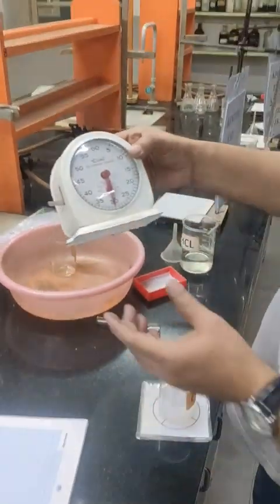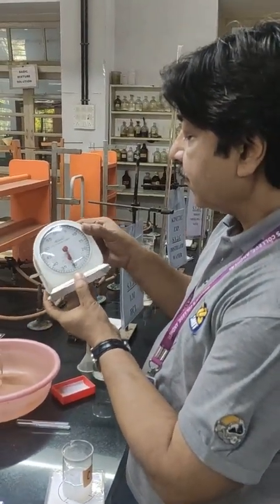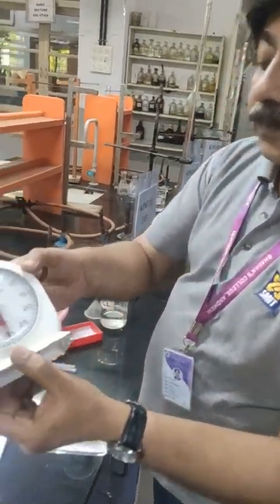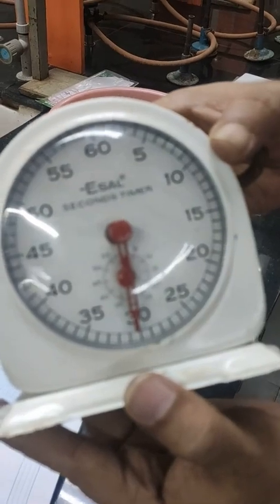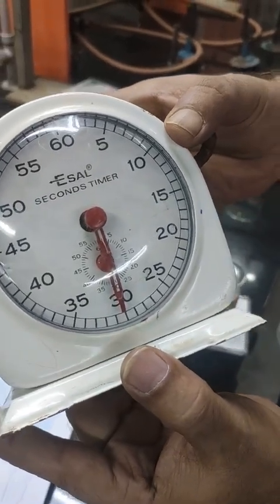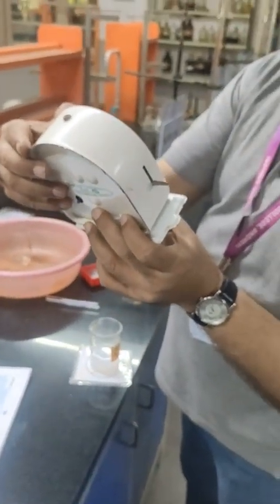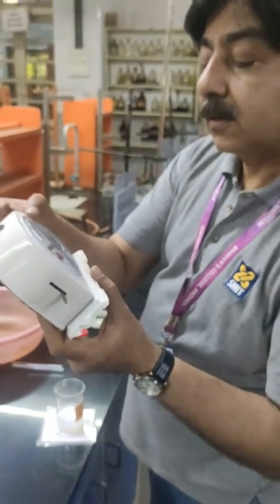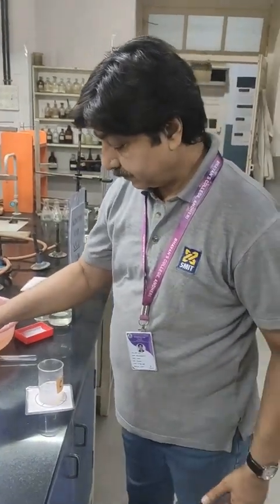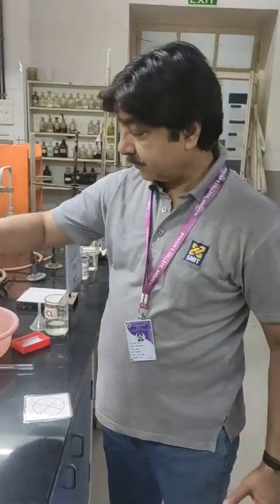I will stop the watch and I will record the time taken for completion. This amounts to 2 minutes and 30 seconds. The solution has turned turbid.